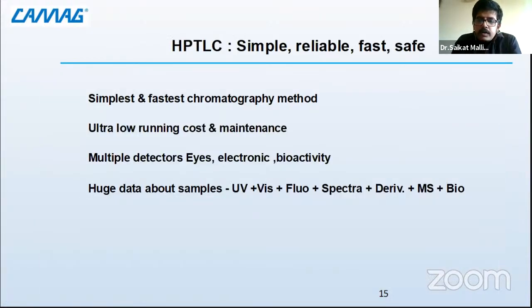Now, HPTLC has many other advantages. These are just a gist, and some of the things which will definitely strike you are simplest and fastest. We are revolving around the same principle, although it is properly standardized and works on different instrumentation, it makes it very simple. You can just start with a plate and the sample in liquid, and you are ready to go. So it is really very simple. Fastest format of chromatography, I'm sure nobody will disagree with me.